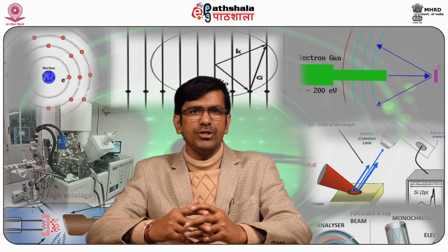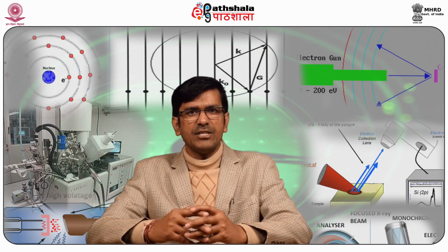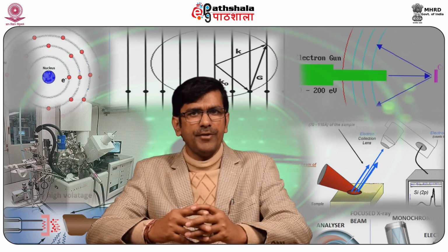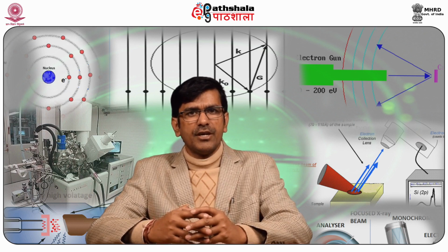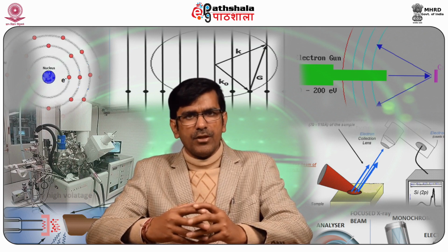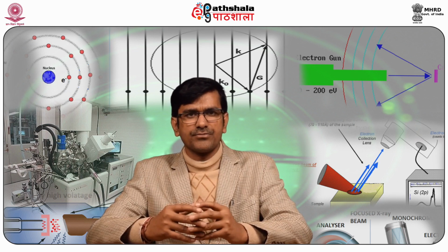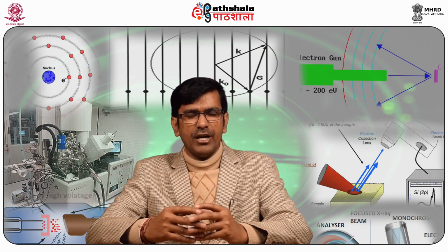Now, about the new developments. Beside the helium first and second line sources, other sources with small natural widths but still higher energies will be developed so that all molecular orbitals can eventually be studied with high resolution. The variety of available soft X-ray sources will also increase, some with a natural width of only a few tenths of electron volts.